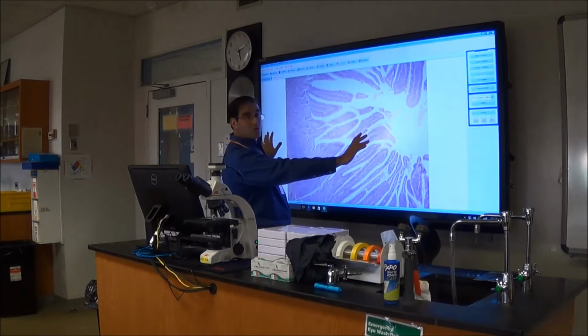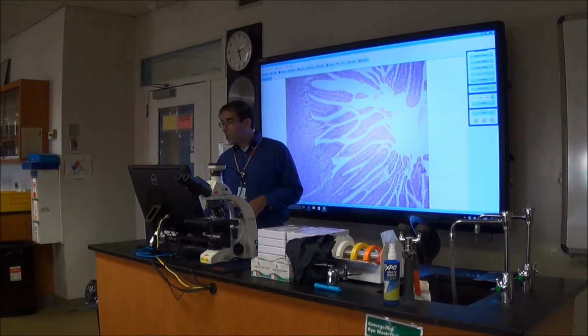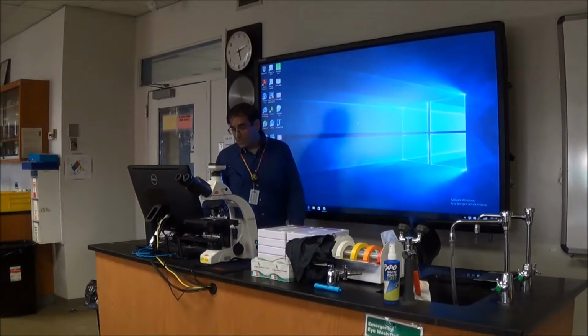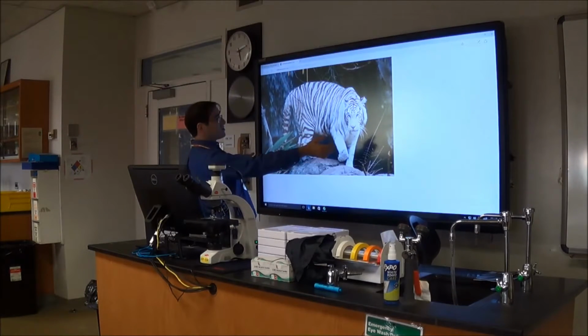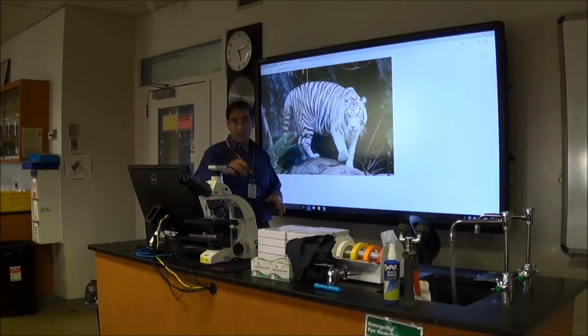While it's still in teacher demo mode, so while this screen is being transmitted to their tablets, you would just shrink this program. So just shrink the program, go back to the Windows desktop. Now, this desktop is right now appearing on all of those tablets. And so say I want to present something on white tigers. Well, here's my white tiger image, and because the teacher demo is still going, this image is on all of those microscopes. So let's go take a quick look.